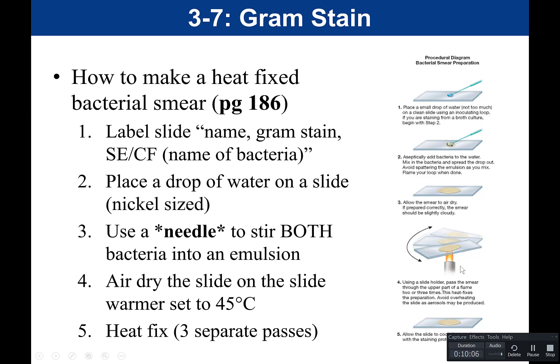Then perform the heat-fix step: pass the slide through the flame three times — one pass and back, two and back, three and back. Why must we air dry it before heat fixing? If the slide is still wet and you pass it through the flame, the liquid could cause the bacteria to splatter. So dry it first, then do three passes through the flame.